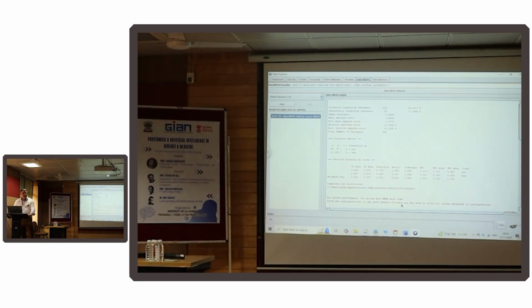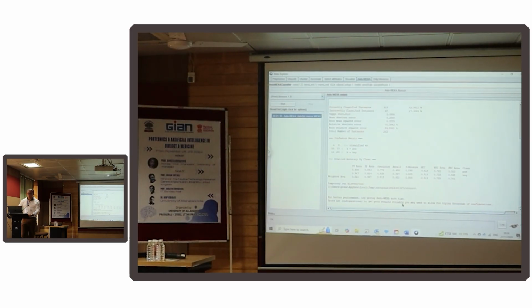It just says if I want to get a better performance, I run it for longer. Well, I kind of knew that. But I would say to get a better performance, I should balance the numbers and run it for longer. Any questions about any of that?